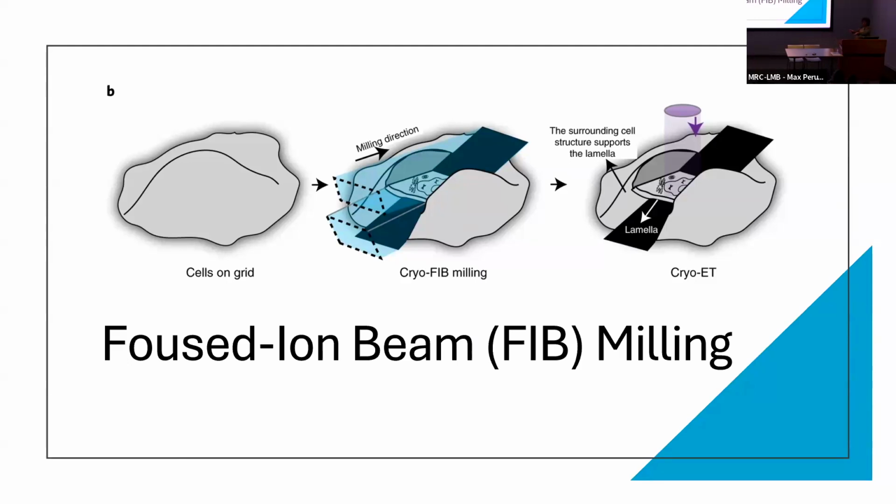The people sit there, don't move. You're not going to turn the patient, you turn the camera. Here, we turn the sample. We leave the microscope and camera, and we turn the sample. But it's similar, we get a similar picture. Because the electron cannot penetrate a thick sample, for 300 kV, this one cell it cannot penetrate.